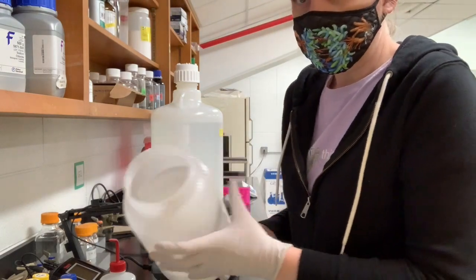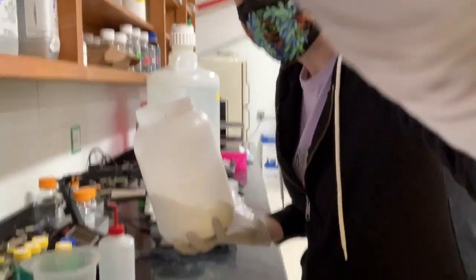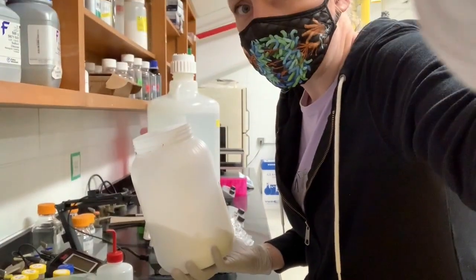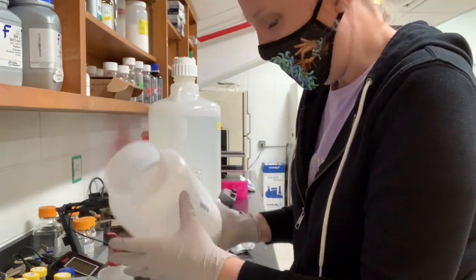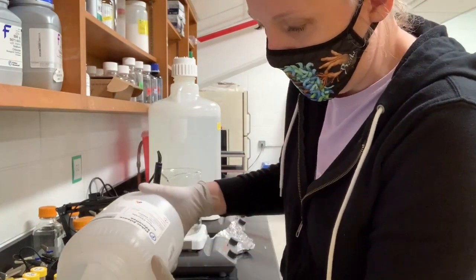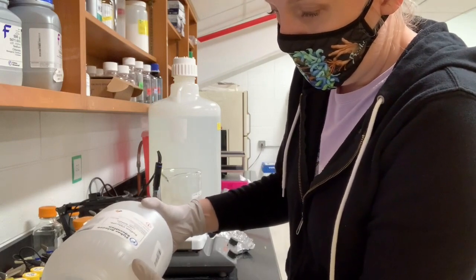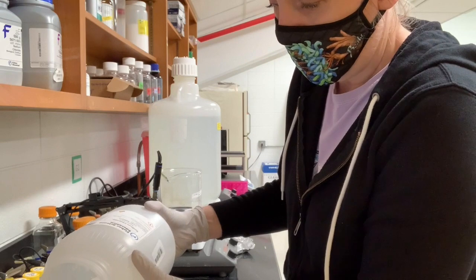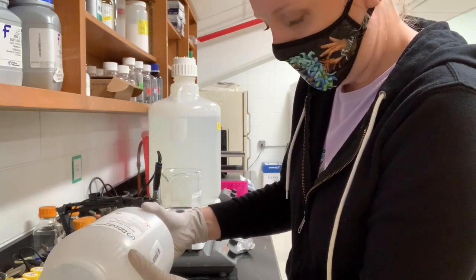So I'm just going to shake this, using the scale. I'm going to measure out my 80.06 grams of sodium chloride. I'm just shaking it and tapping it to get close.